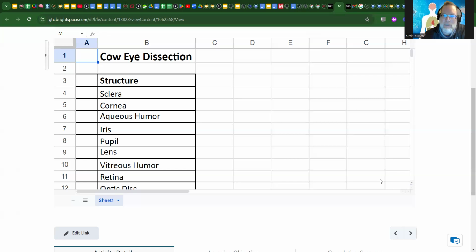So when you're looking at the musculature of your eyeball and you're peeling it back and trimming it up, there'll also be some fat. Whitish yellow is always fat, and then a reddish, gray, brownish color is going to be muscle. Whitish, yellowish is always fat.